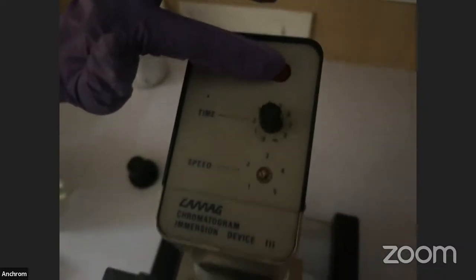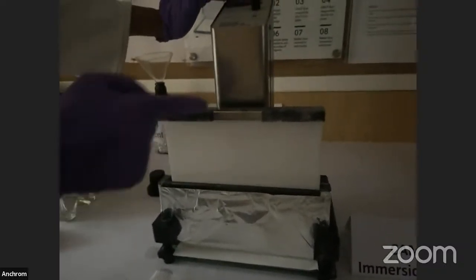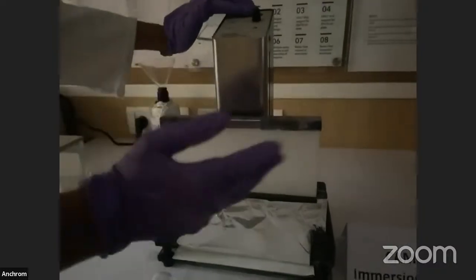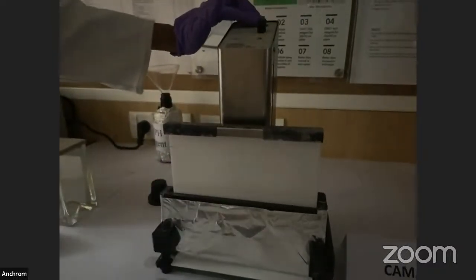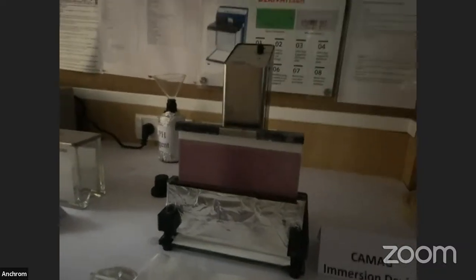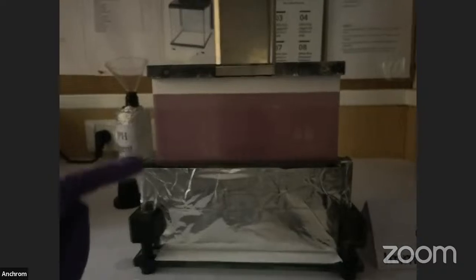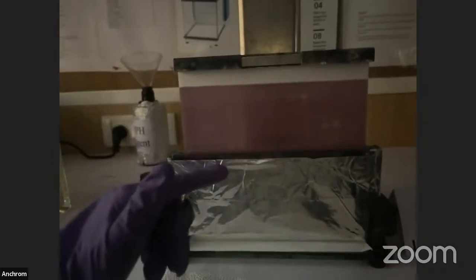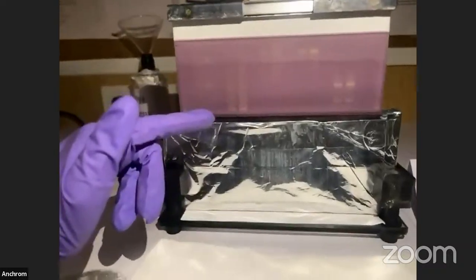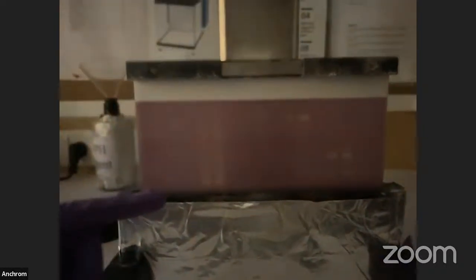The plate will go inside this dipping chamber and within 5 seconds it will come out. After that you will be able to see the yellow spots on a violet background. You could see the separated bands that we have achieved during the development after performing DPPH activity of the samples. The yellow bands indicate the antioxidant activity of your sample.